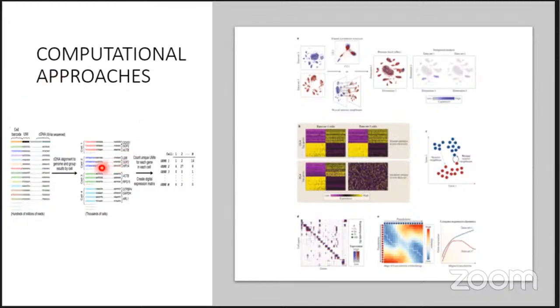So we can see the different kinds of reads here. The red color is of one type, the blue color is of another type. This kind of clustering is performed, and from it we make the matrix. Now imagine, from one sample, if we have 10 types of cells, we get 10 clusters, and in each cluster we get thousands to millions of reads.